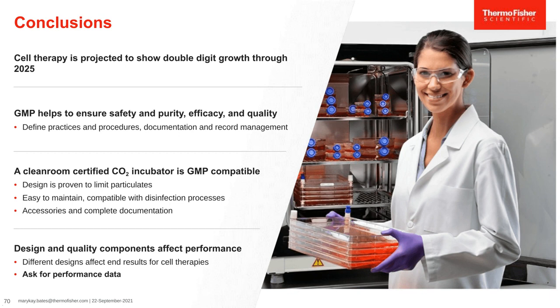Finally, those design and quality components affect the performance of the incubator, and different designs affect your end results for your cell therapies. You should ask for these performance data from the manufacturer. They are available, and you should know this and how it's going to affect your process.